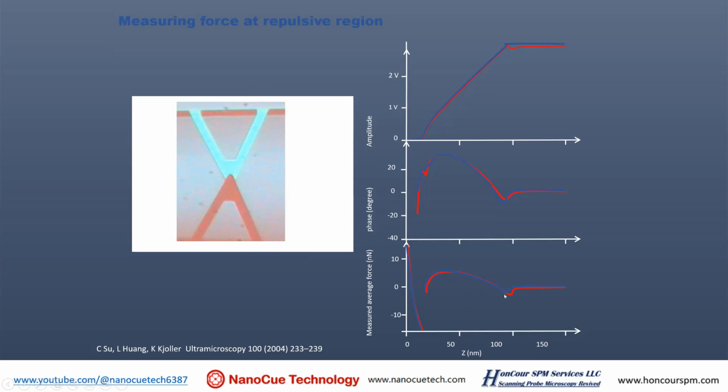And then if you compare the third line to the second line, they mimic each other. And that's further proof of our point, that you can actually look at the phase versus distance curve and then measure, understand the force. And that's only true when the set point is at the first, let's say, from 100% all the way to, let's say, 40%-ish.